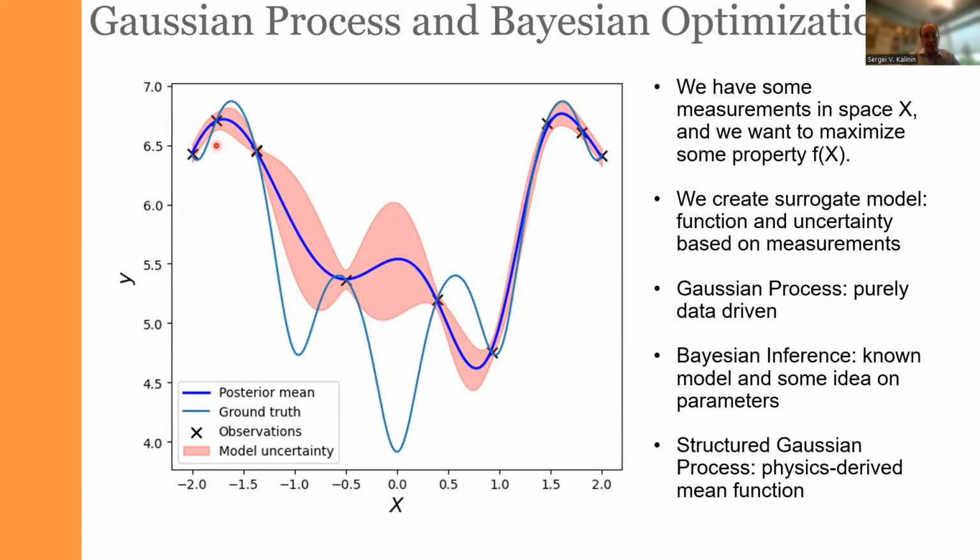Comparatively, y, our target parameter, is usually either scalar or low-dimensional. If it is a scalar, then it represents something we want to optimize, for example the resolution, or something we want to minimize, for example beam damage. There are also ways to treat the situation when y has several components, so we want to optimize them jointly. That's called multi-objective optimization. And there are cases when we actually want to generate a multidimensional y. This is called latent variable Gaussian models. Again, we are not going to consider it for the time being.